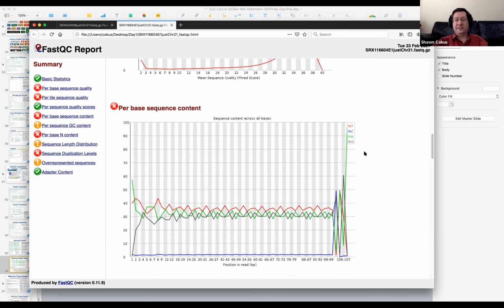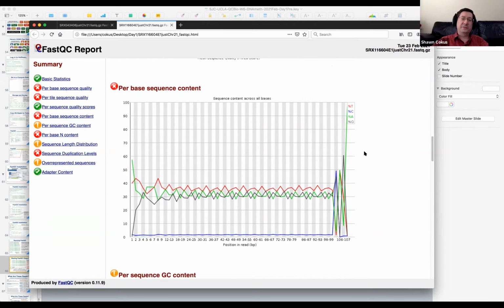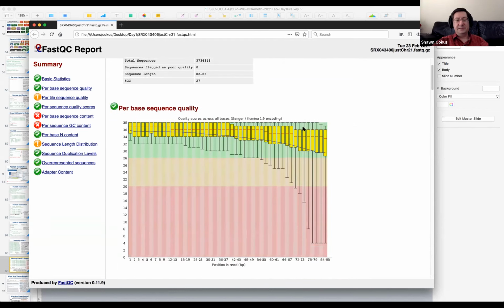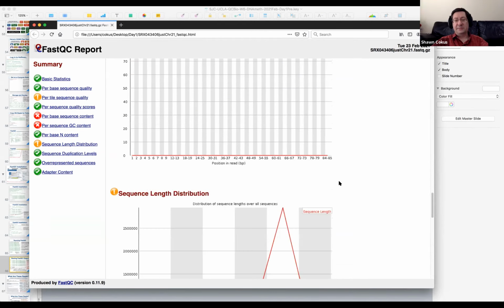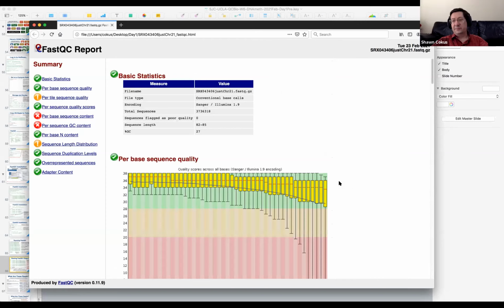But a lot of things come down to the particular regime that you're in, and different genomes don't have the same statistics. So what I'm seeing from looking at these reports, given that we want to keep things simple here, is that I'm thinking to cut off the first roughly 10 bases and cut off somewhere from the mid 70s to the end, and get them all to some common length, maybe around 65. Right, 75 minus 10 would be 65. So that's the plan.